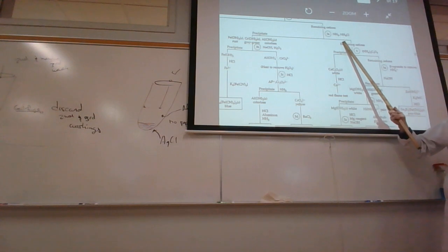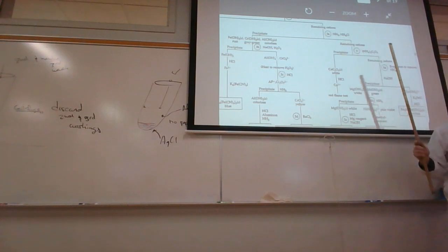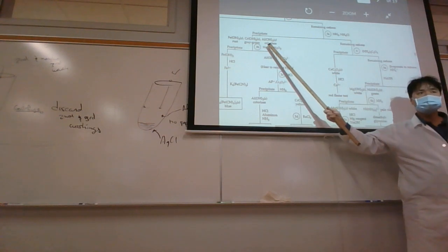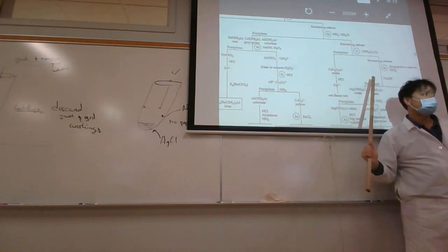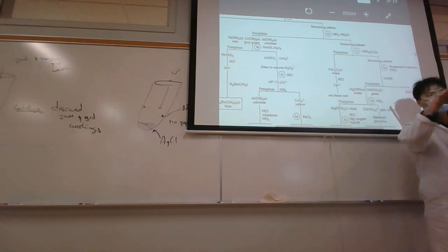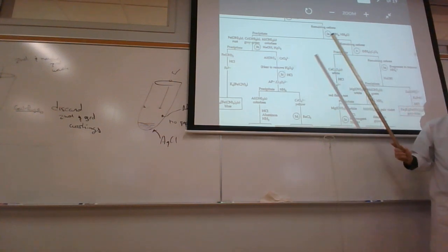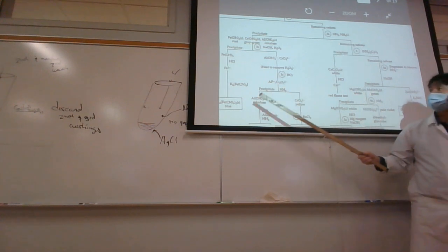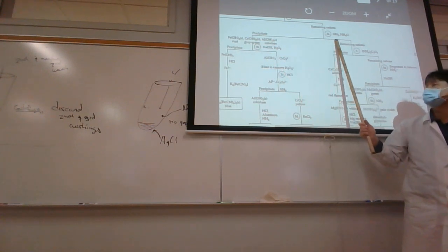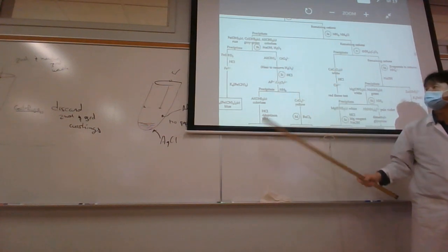All right, so this precipitation is a bit tricky because this is what we call selective precipitation. The selective precipitation is precipitating out the +3 and leaving the +2 in solution. And so we have to use the right amount of hydroxide. Later on we can calculate the pH at which these precipitate. So at about a pH of 7, all of these should have been precipitated out.